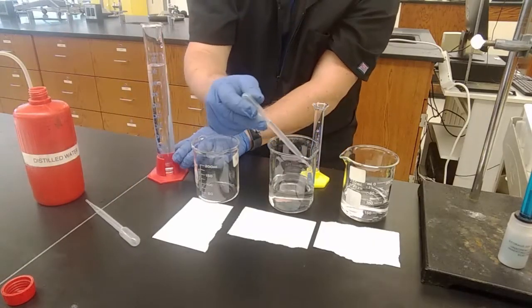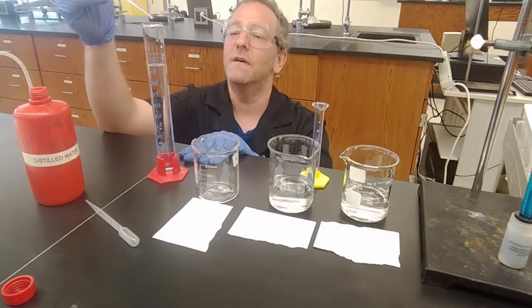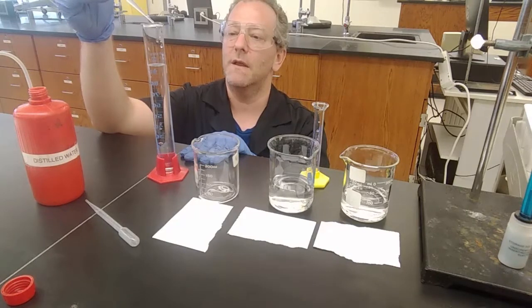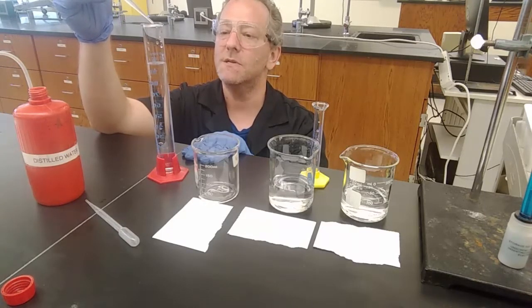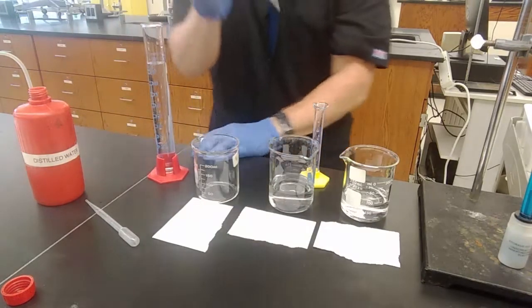And exactly 1 milliliter of number 1 to make number 3. 20 drops is considered a milliliter, but I want to use my precision measuring device here to get it really exactly, rather than just guessing.